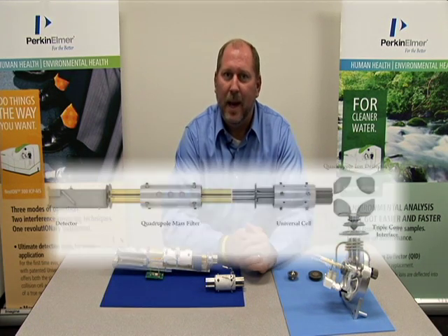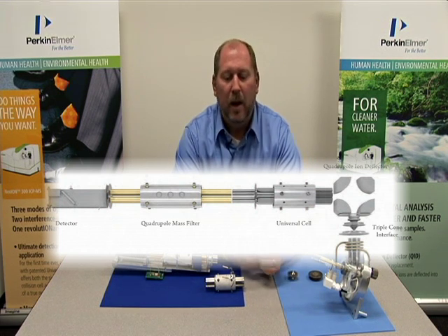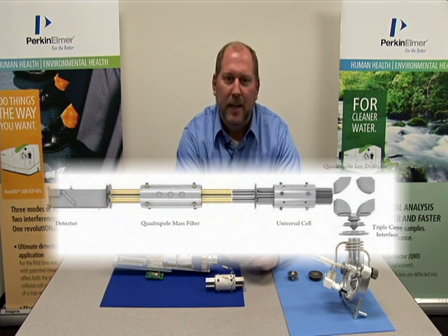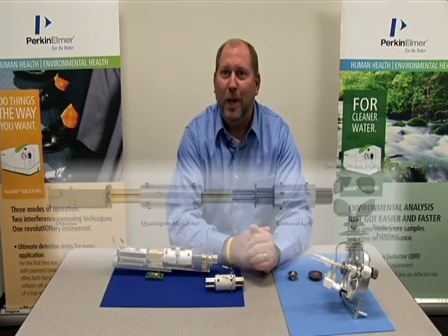So we have now what we call an ion path. The ion path is basically a guide to get the charged particle from the plasma all the way down to a detector. And that's where all the magic comes in — instead of smoke and mirrors, now we have rods.